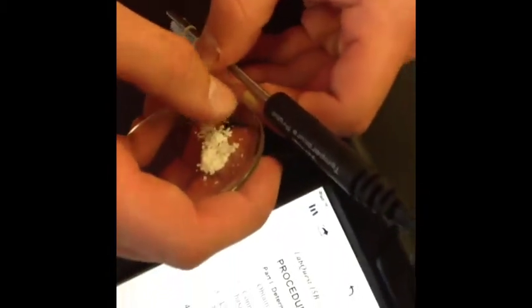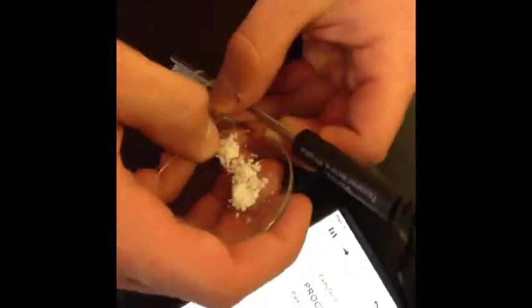So here we have Max doing just a great job of getting the salt into the tube. Let's not joke around. No sarcasm. This is for a grade, Nick. So he's just putting it in the tube there. And we're going to end up putting it in the water bath and melting it pretty soon here.